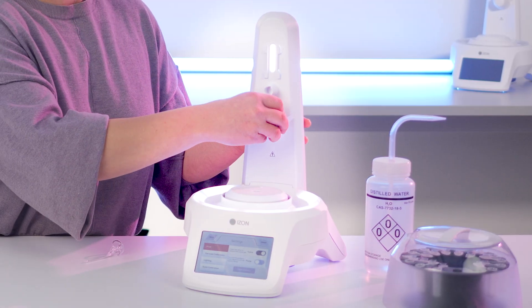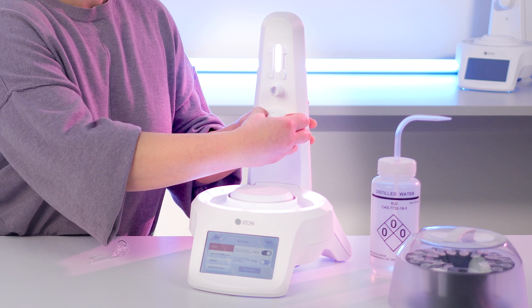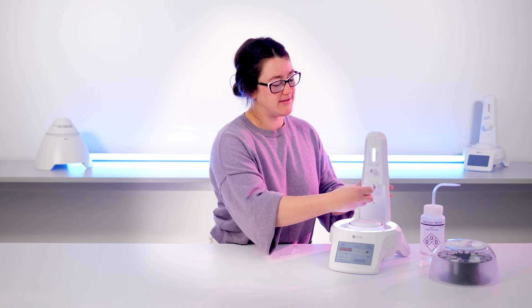Now let's get to it. Note that you don't need your QEV column to do this. Remove the pinched valve cover by grasping it firmly and gently pulling away from the AFC tower.